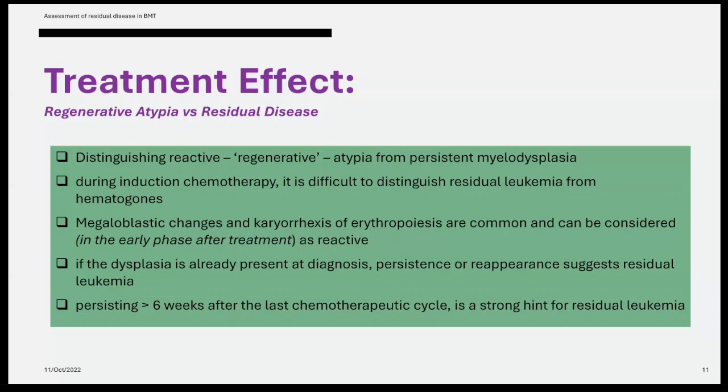We have encountered in our practice here in KK that sometimes with patients on day 15, especially pediatric leukemia, we have a very brisk TdT positive population, then it's very difficult. But then after 1 month or after post chemo, you see the pattern.